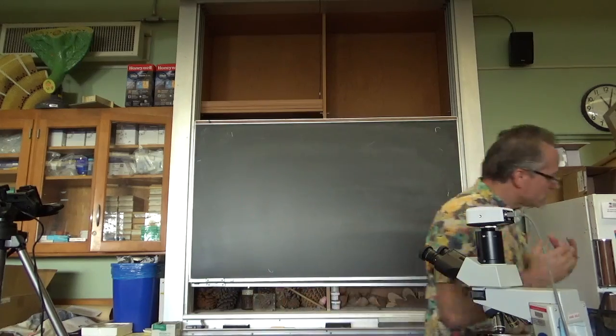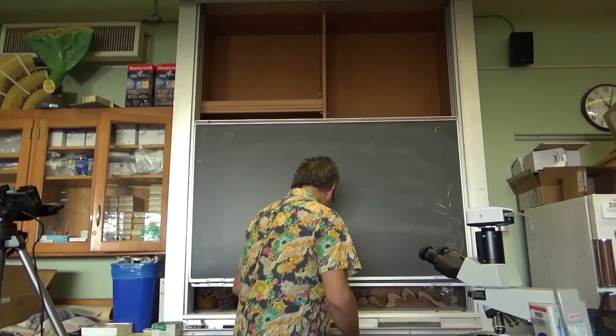You have lab handouts printed out. And so we're doing comparative systems. We're focusing on just 3 systems. That is ingestion and digestion as one system, respiration, and circulation. Each of your stations has a different type of critter, some of which are live, some of which are not so alive. You are going to be making sketches of each of these systems because you're doing one group of animals and then you're going to teach the anatomy of that animal to your colleagues.